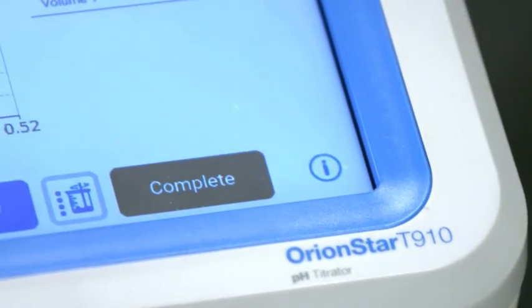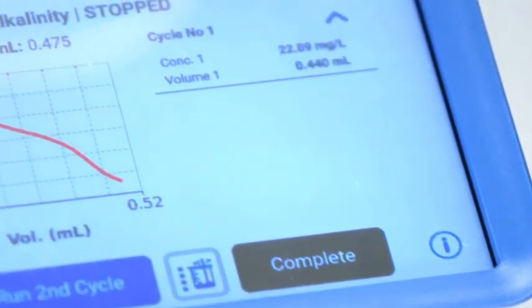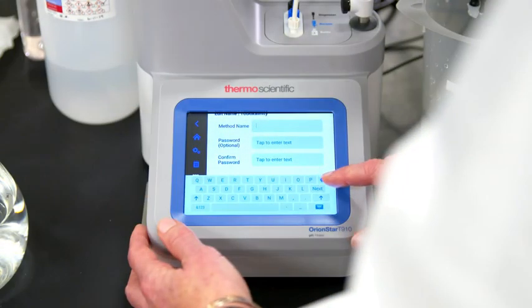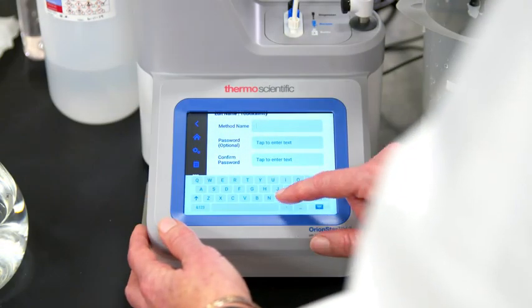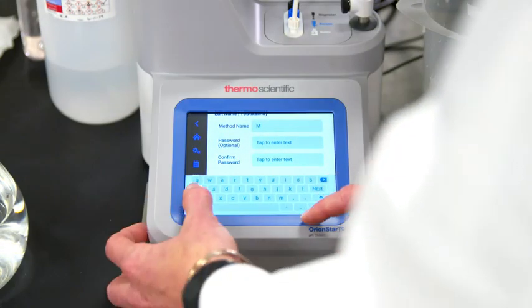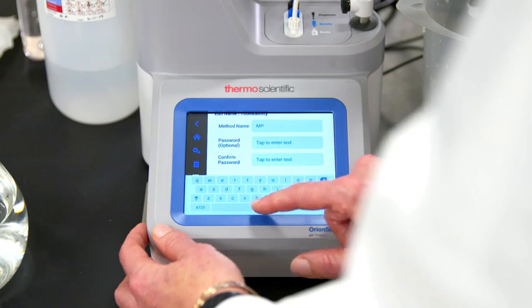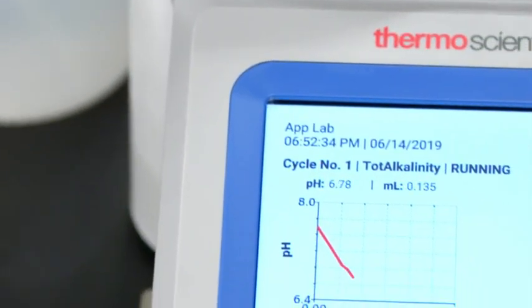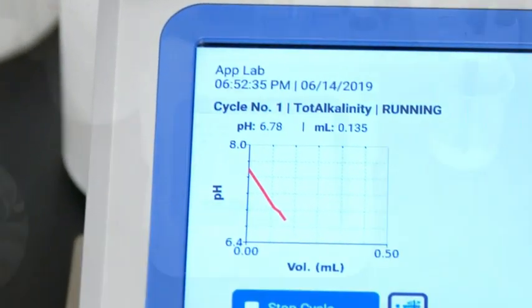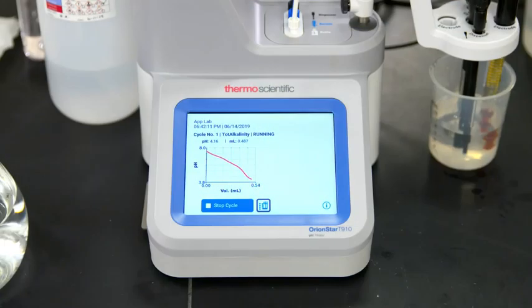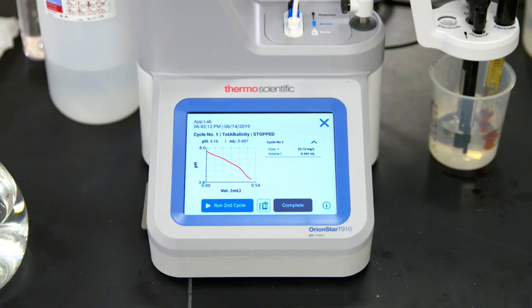One of the benefits of the Orion Star T900 titrator series is that you can password protect your method to ensure that no matter who runs it, you get the same result. When the titration is complete, you'll hear a beep.